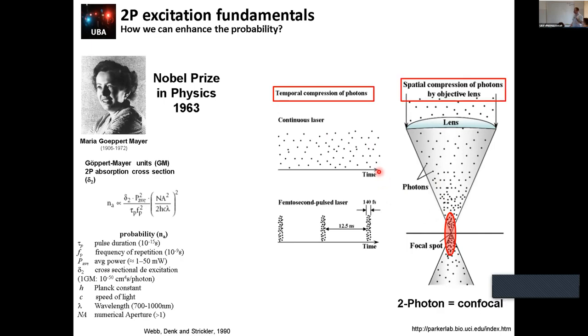So when we talk about this, we always intrinsically speak of confocal microscopy. So we don't need a pinhole in two photon excitation.